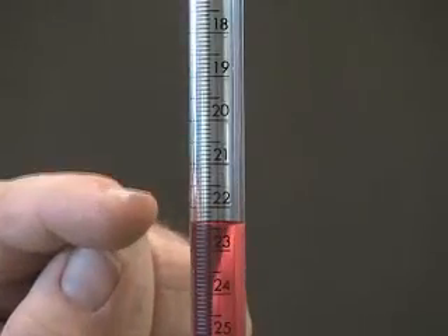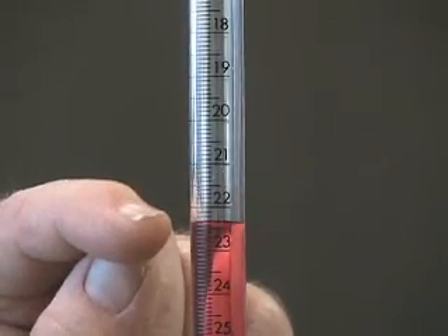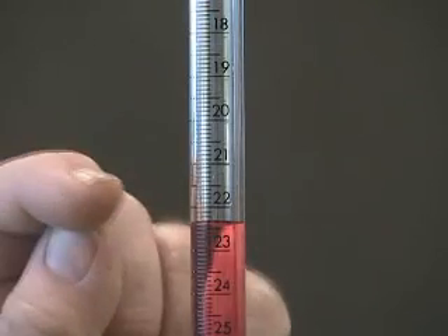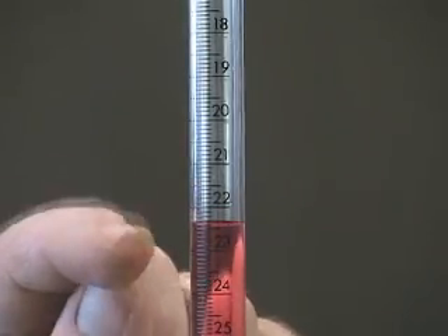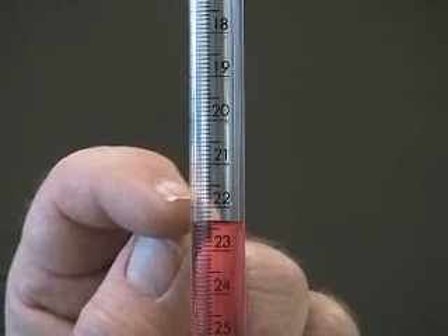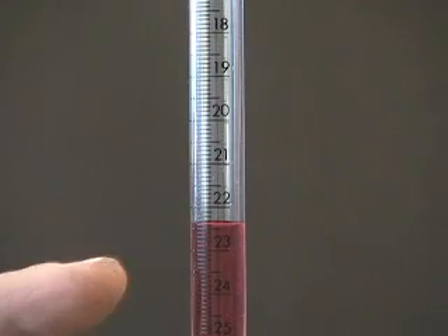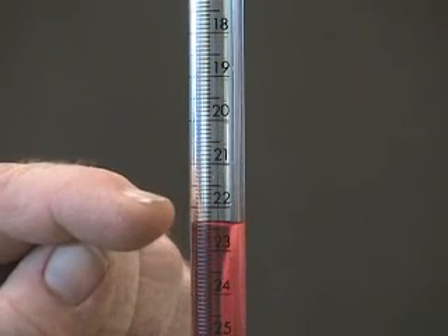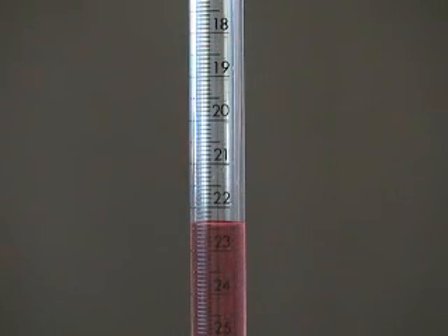If we notice the scale — you've had some practice with rulers in your lessons — you can see that the number at the top above the liquid is 22 and the next numbered line is 23 down below. So this volume is between 22 and 23 milliliters. You can see that the divisions between 22 and 23 are the shorter lines, and the volume between 22 and 23 has been divided into 10 equal divisions.